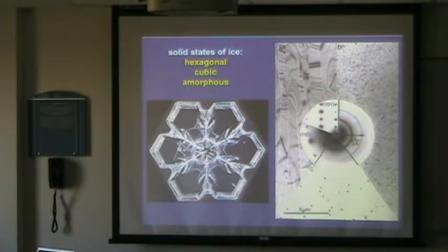which is just immobilized. This here is cubic ice. This is very beautiful cubic ice where you see the spots. This is the kind of cubic ice you typically encounter in your microscope if the freezing went bad. And then you get these kind of sharp lines based on the water molecules, which should really disappear in the case of vitrification, where the water molecules are in all kinds of random orientations. And this is the kind of state you want, vitrification.